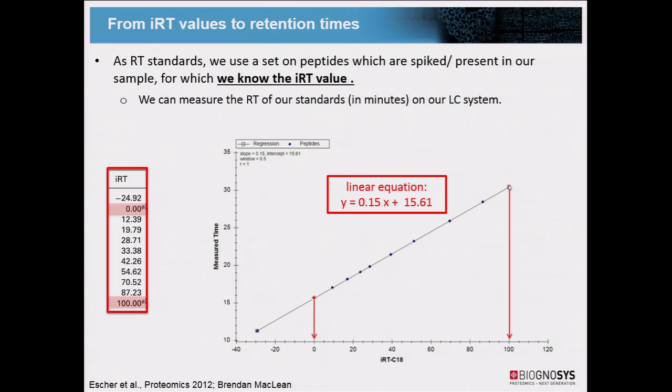So we can convert these IRT values, which are indexed values and don't have any unit, into retention time in minutes, which has a unit of a minute, using a linear dependency.